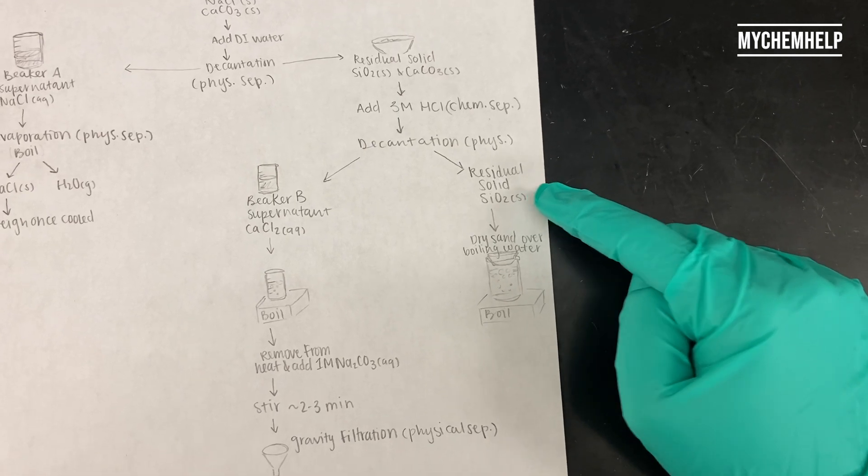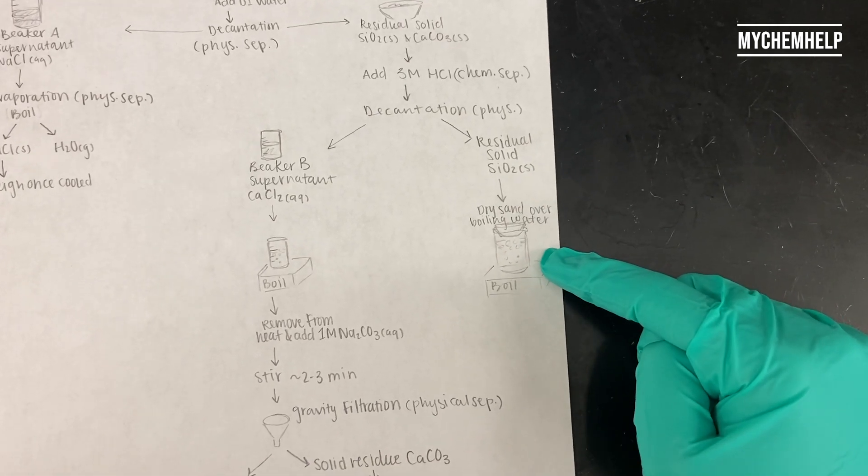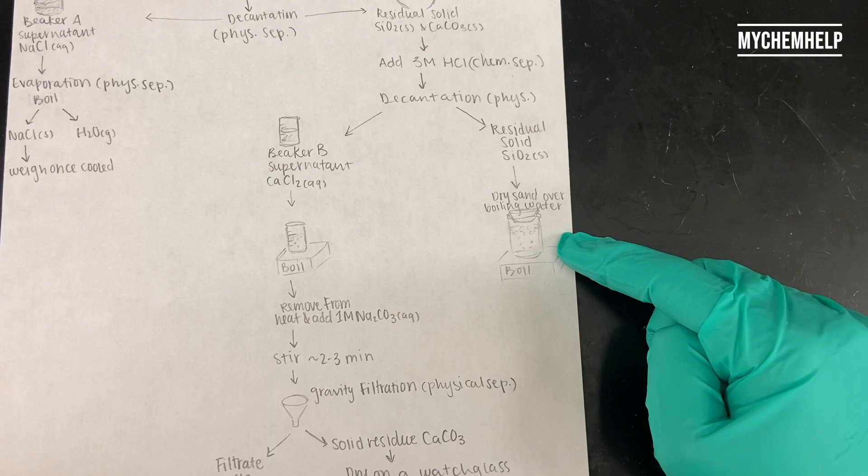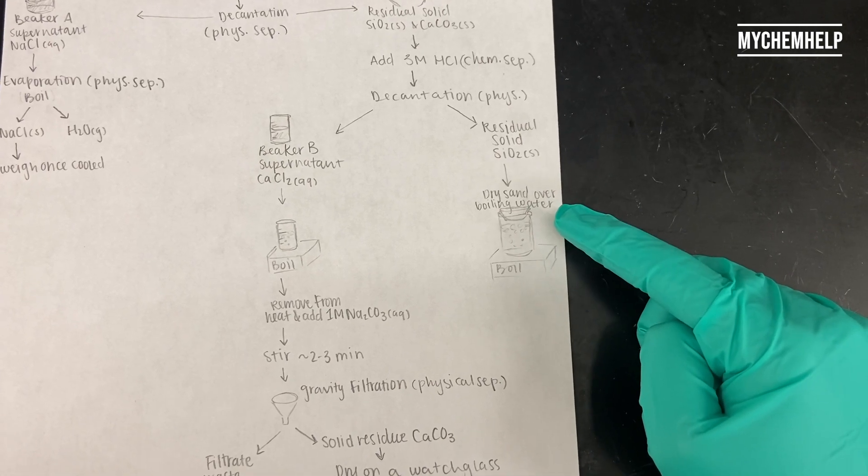And that silicon dioxide, we are going to dry over boiling water, and that's pretty much it. Once that's dried, we can weigh out the sand.